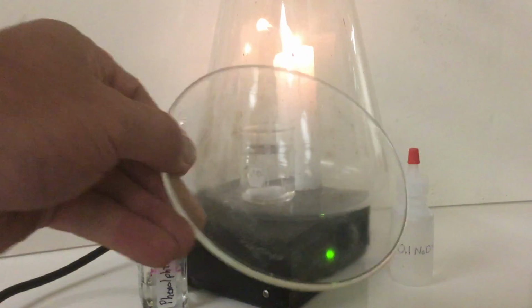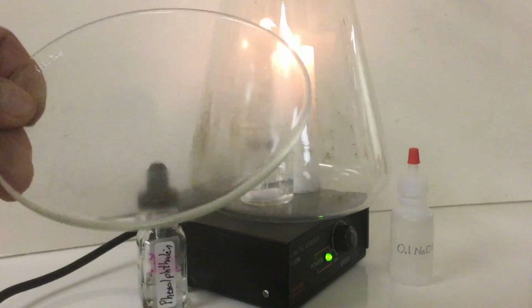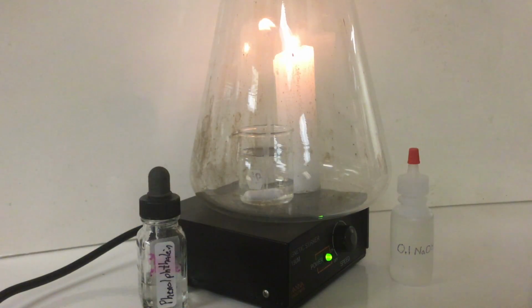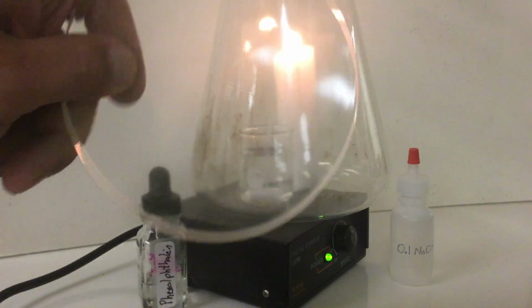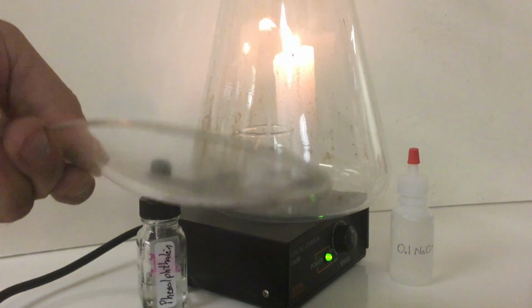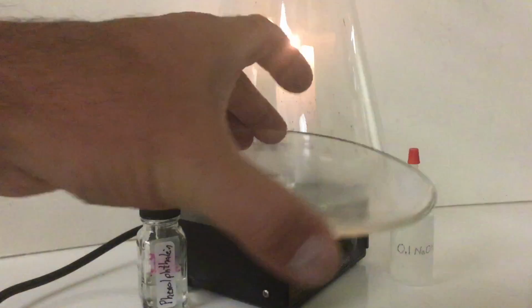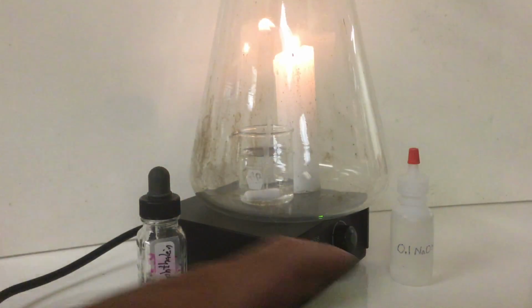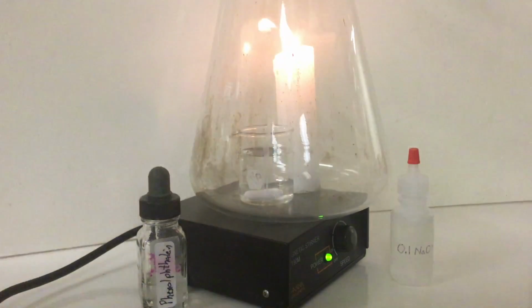Okay? Now currently, I have the earth open. So everything is rushing off planet Earth. That's not normal. I'm going to finish creating a closed off earth once I get everything squared away and we start the demonstration. I'm going to do that by putting on top of it what's called a watch glass. It's another piece of chemistry equipment. It's just a curved piece of glass that we put samples in. We can use it as lids for flasks and such. So when I'm ready, I'm going to tell you that I'm going to close the flask off, and you'll know when that happens. I'll tell you. You won't see it. I want you to be able to see what's happening here.